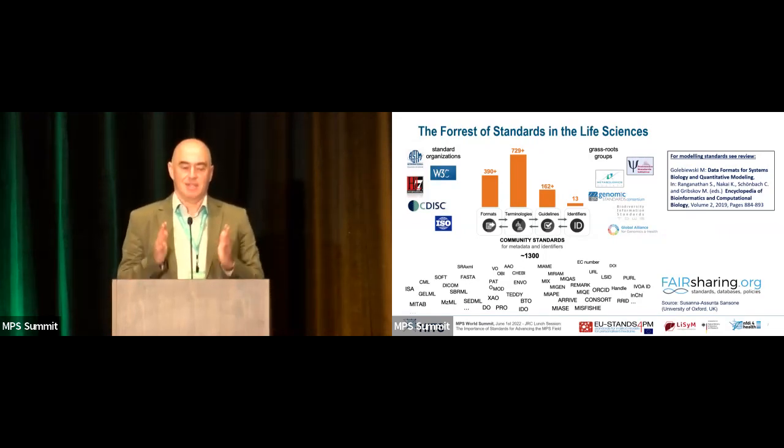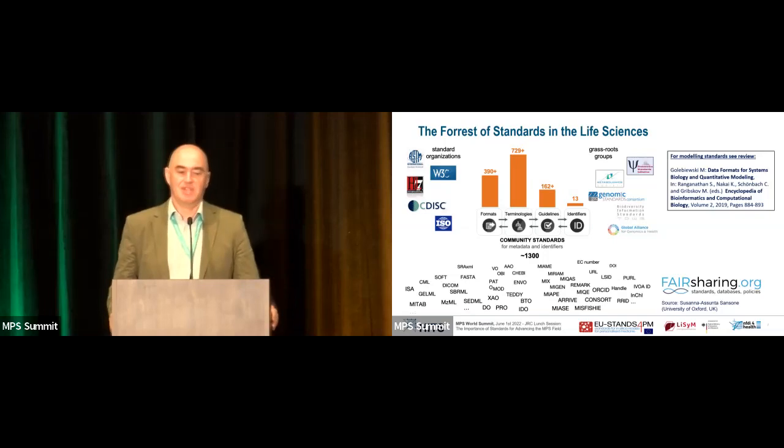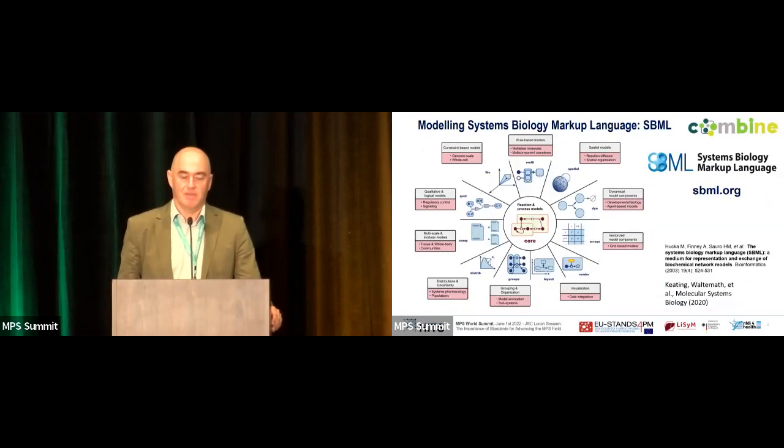And this forest of standards is really complex. You have hundreds of formats for the data, hundreds of terminologies and hundreds of guidelines, because you have all the different subdomains, all the different technologies that you have to apply in your system. And so it's really a forest that you hardly can look through.